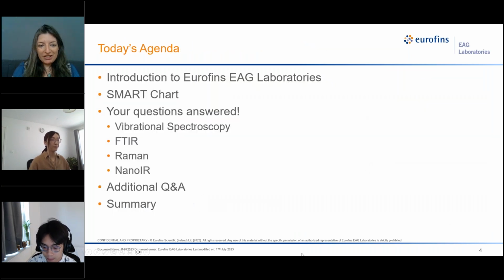Okay. So now for today's agenda, we're going to start with a brief introduction to EAG, what we're all about. Then we'll talk about our famous smart chart. And of course, the bulk of this presentation is focused on your questions. You submitted more than 400 questions, and of course, we're not going to cover everything, but we're going to go into the most interesting ones, and all your questions will be answered, rest assured. So we'll start with vibrational spectroscopy, FTIR, Raman, NanoIR, and if we have time, we'll have your questions from today, and we'll end with a brief summary.